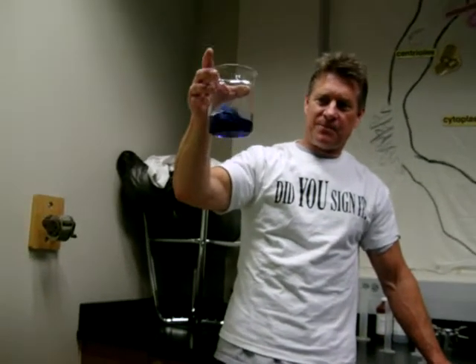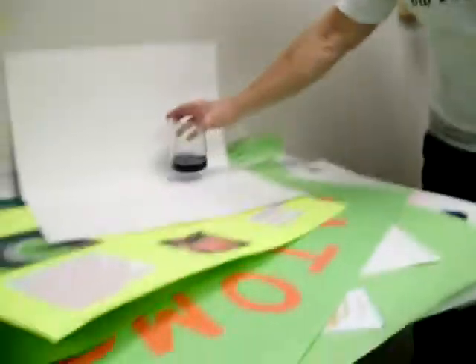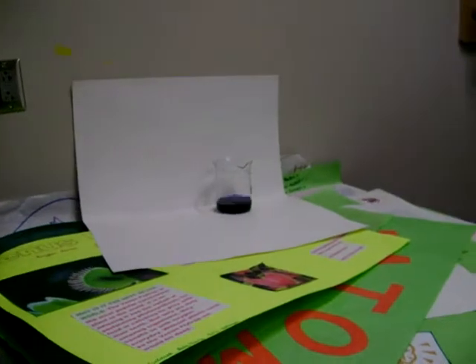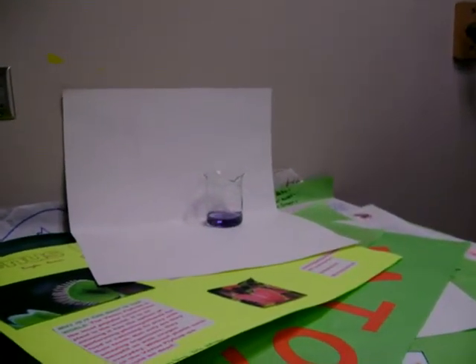We do know that it takes iodine to make this work. Remember, if you've ever done a starch test on potatoes — you put iodine on a potato, you get a reaction — and that's kind of what this is. I'll just set it here and we'll look at it this way.